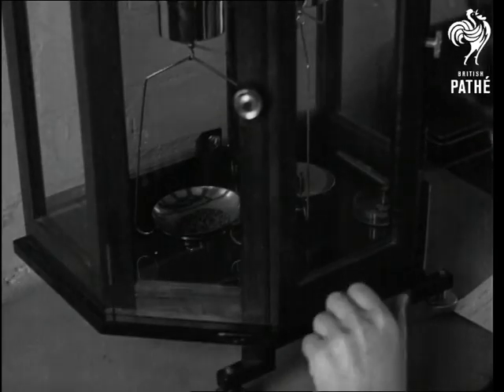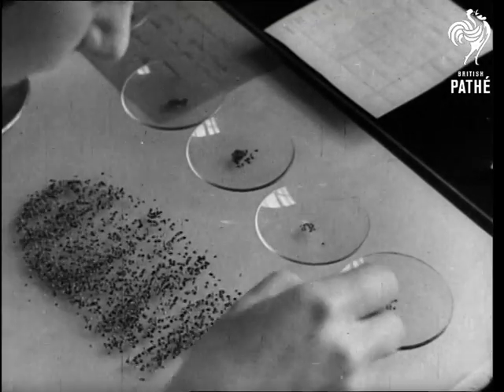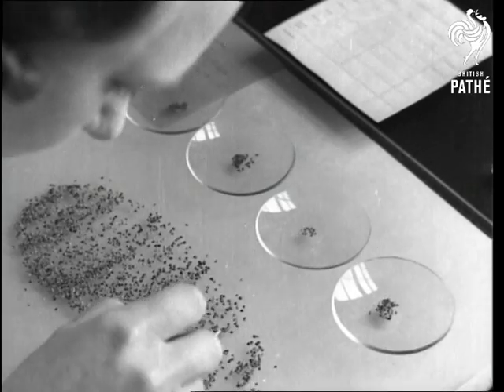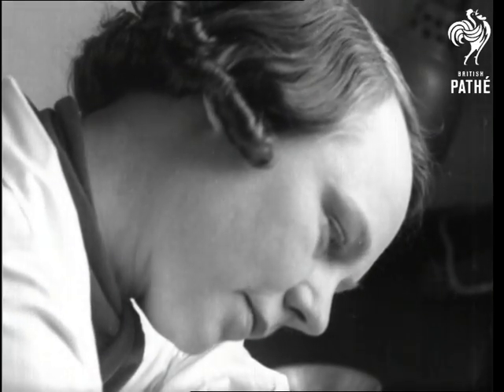Two duplicate lots are taken from each sample. Pure clover seed is separated from the weeds and other impurities in both samples, and from these the percentage of good and bad is determined.